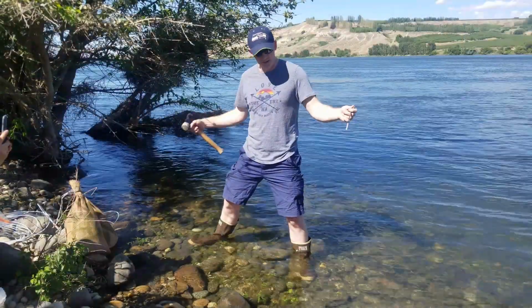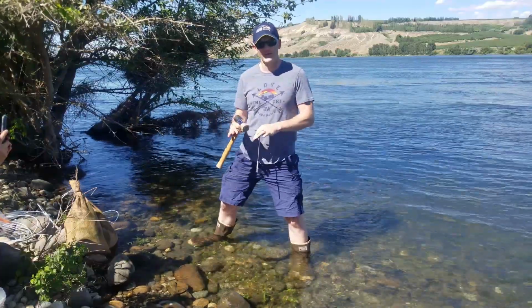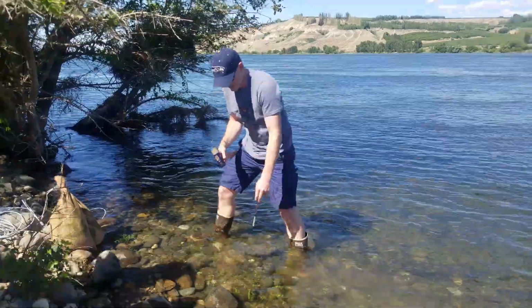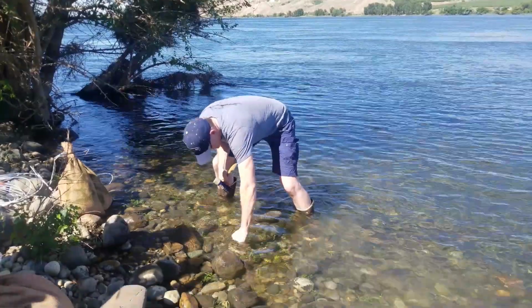You're going to choose your location. You want to install the push point in a location that's going to be inundated for the entire duration of the 2-day sampling. So sometimes you've got to poke around, try to get it in there.